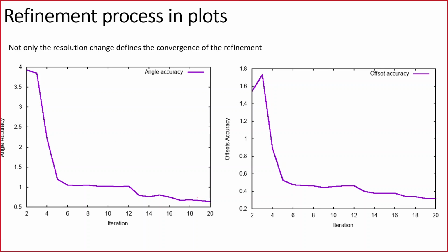And then we found that by these later stages, 18 to 20 iterations, we are no longer moving or rotating our particles. They are more or less staying in the same orientation, and they are not improving the resolution. So this is also one of the criteria for finding that our refinement ended or converged.